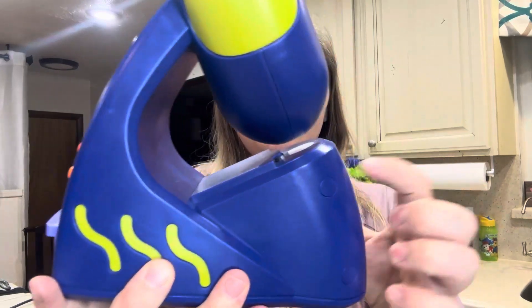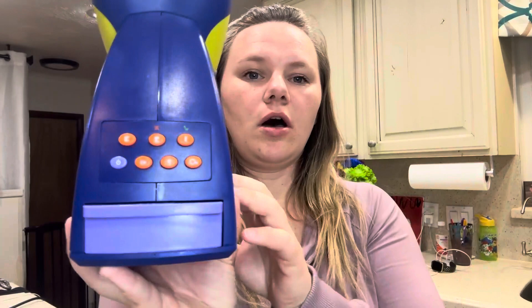We've had this for about six months and we absolutely love this. It's made out of plastic, it's got like a little speaker on the side, and it is just battery operated. You change out the batteries right there on the back.